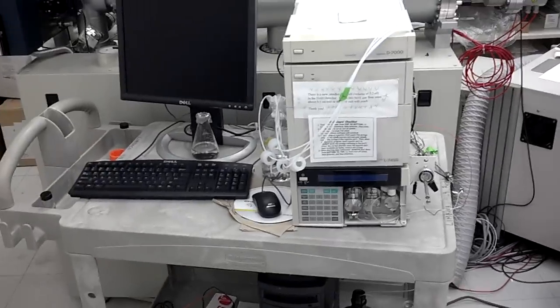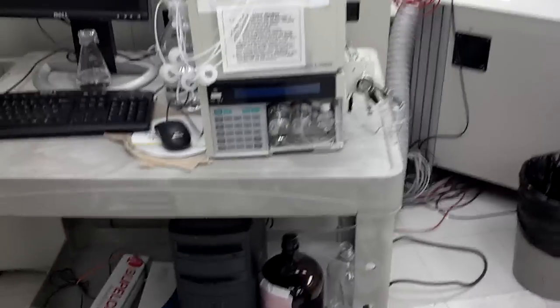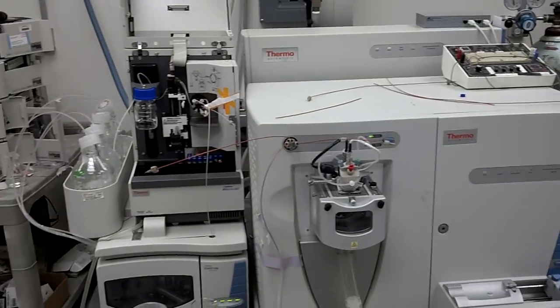This is another analytical instrument, another mass spec. This is the LTQ. This is the one I'll be working on. It's a mass spectrometer.